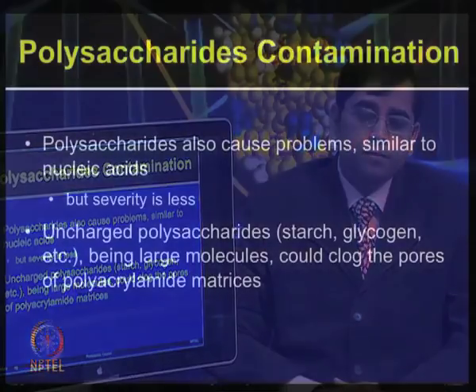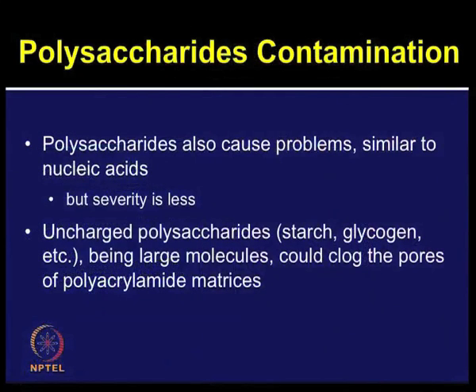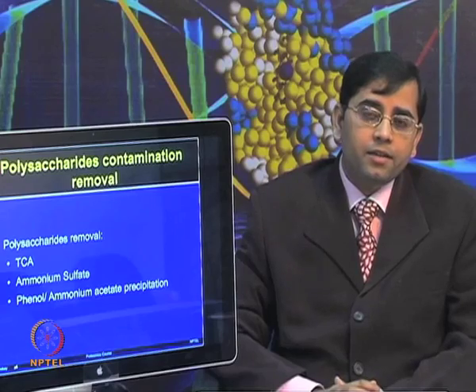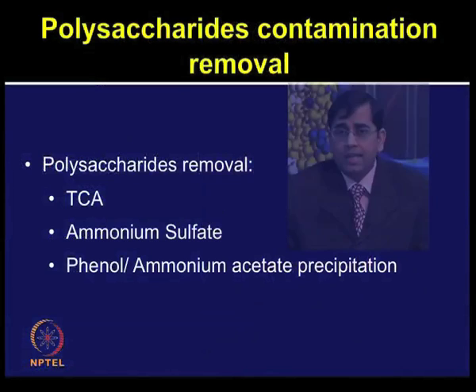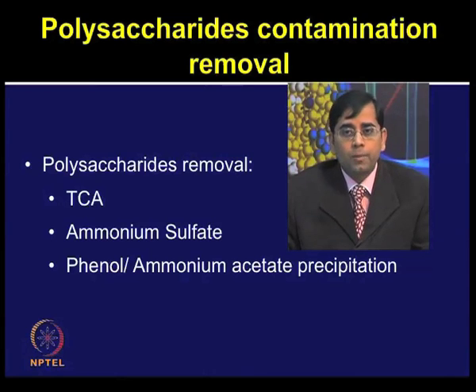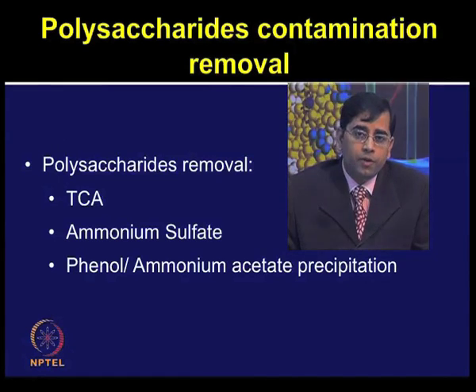Polysaccharide contamination, similar to nucleic acids, may also cause problems, although the severity is less. Uncharged polysaccharides such as starch and glycogen are very large molecules and can clog the pores of gel matrices. However, during the precipitation step itself, a lot of polysaccharides get removed. TCA, ammonium sulphate, phenol, or ammonium acetate precipitation are efficient ways of removing polysaccharide contamination.